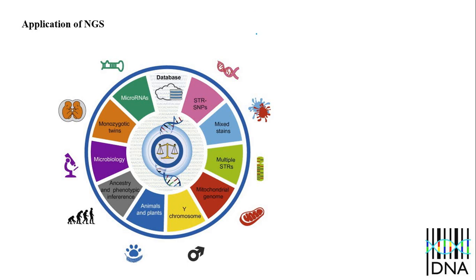Application of NGS. First and wider application is whole genome sequencing. Second application is whole exome sequencing.